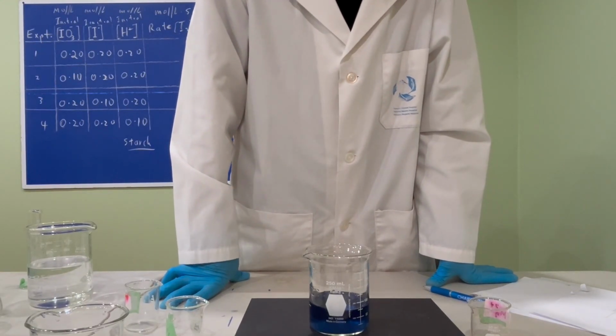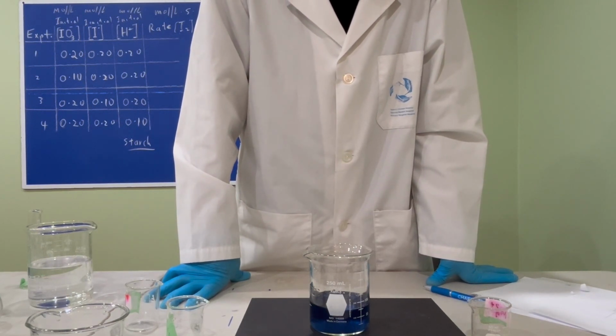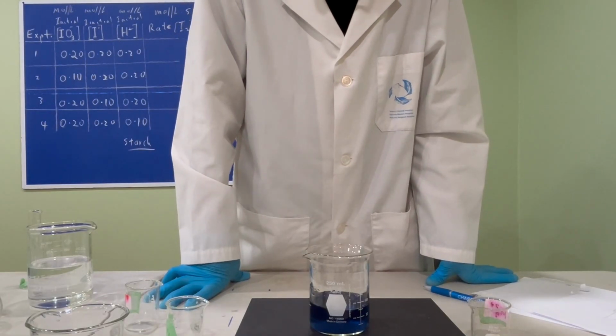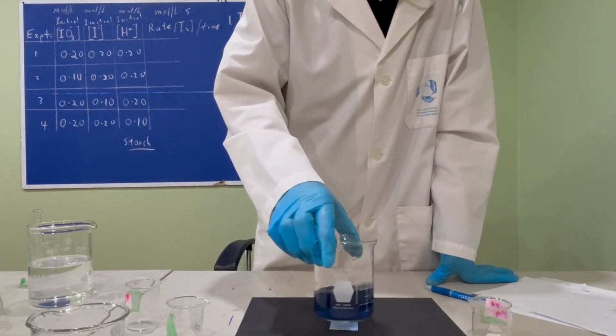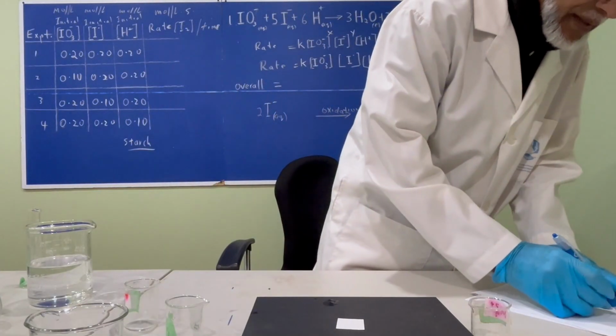From my vantage point, it's about to clear up, it's about to disappear. Give it a few seconds more. I would say it's about time now that it goes, okay? Somewhat subjective. All right, so that's the third experiment. 65 seconds.